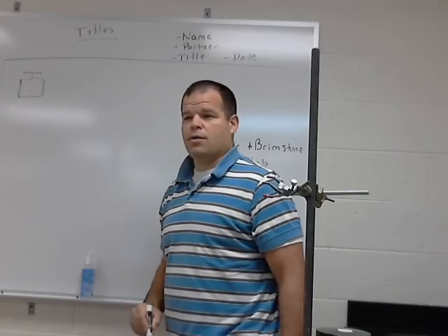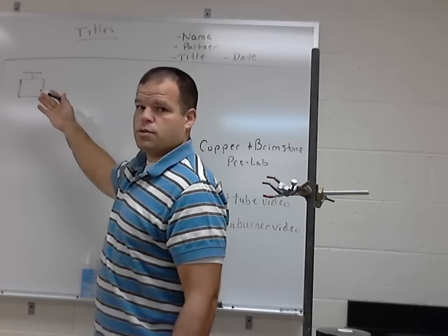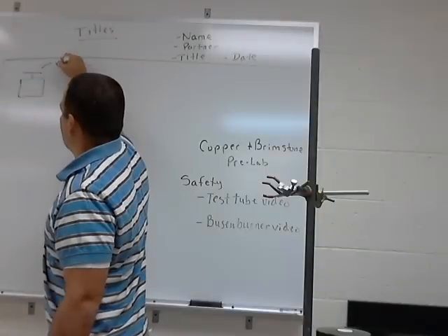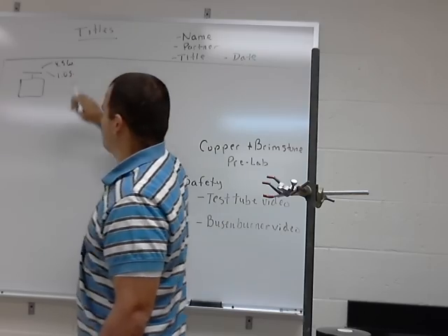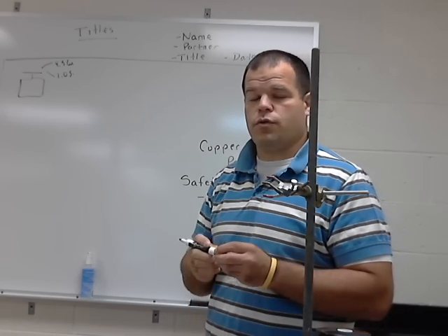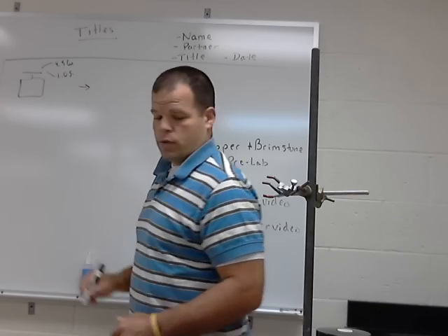Okay. Now again, it might be hard to see that, but it doesn't matter. This is a box with a seal on top, and I'm going to use pictures. So I might say, let's say, 4.5 of the copper and then 1.0 of the sulfur. Okay, so these are crude pictures, but they're for you. It says that you know what you're doing and you're regurgitating it to me, so I know you know what you're doing.